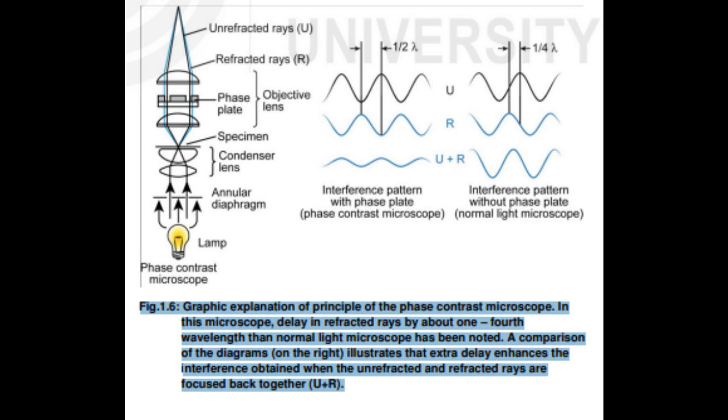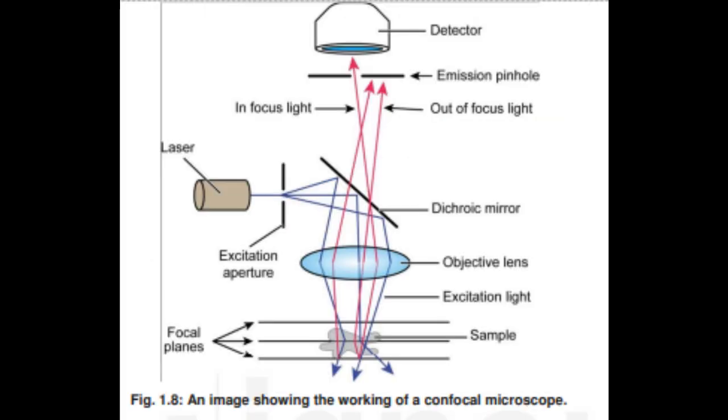1.2.4 Fluorescence microscopy. A fluorescence microscope is used to see tissues that fluoresce, absorbing one wavelength of light and emitting another. Light of one wavelength excites the fluorescent molecules, while light of another wavelength collects the emitted light.